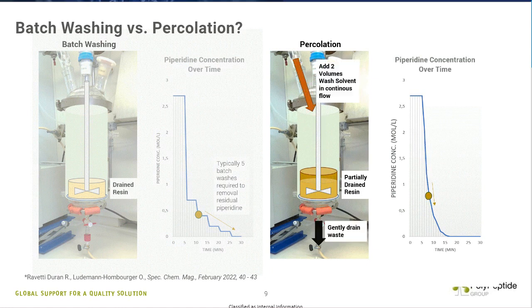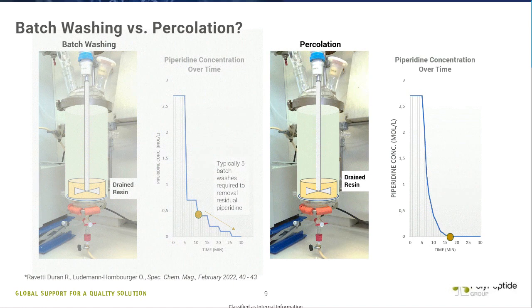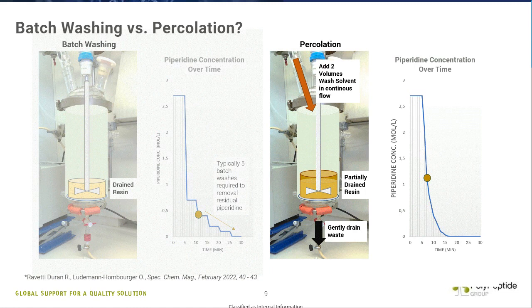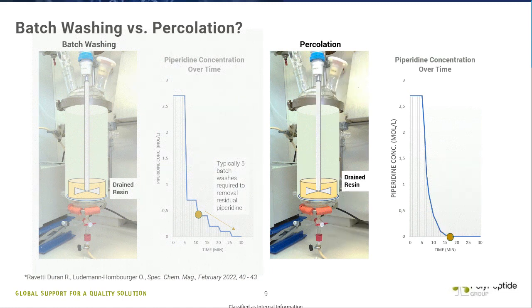So in terms of homogeneity, this is not really an issue. The flow going in is fixed, and our draining is also managed by a pump going out. The whole system is fixed in terms of the pump pressure we have going in from either side. So in principle, this controls and minimizes any inhomogeneities that you would have in the resin itself.